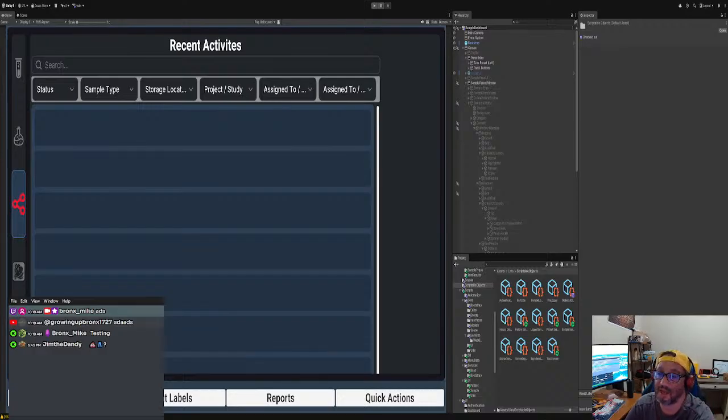You are not going to be able to manipulate any test from the sample scene. You'll only be able to do that on the test scene. Okay, does that make sense? Reason being is because you want to make it on purpose. You don't want people to do a test by accident. And also you make sure that your sample scene runs very smoothly and fast, so you don't have to fix it. Plus remember, the SOLID principle, single responsibility principle, a class should only do one thing, and we should do that. We should move that further.